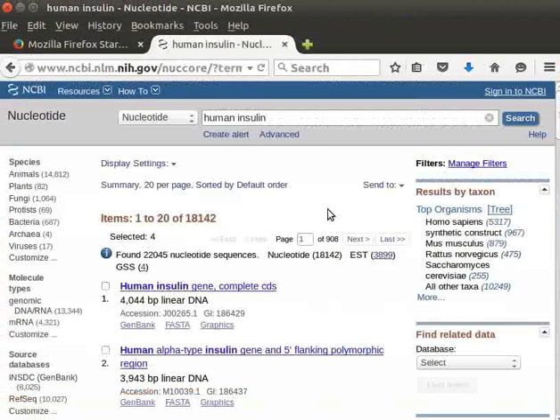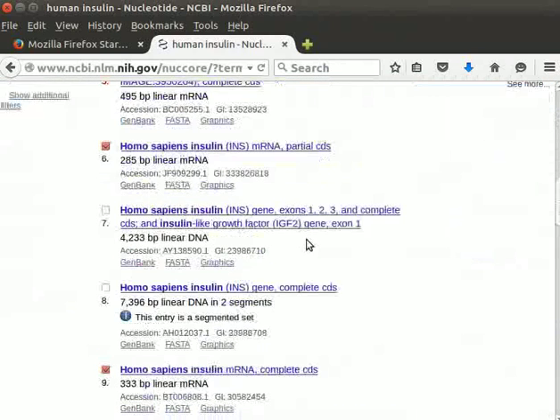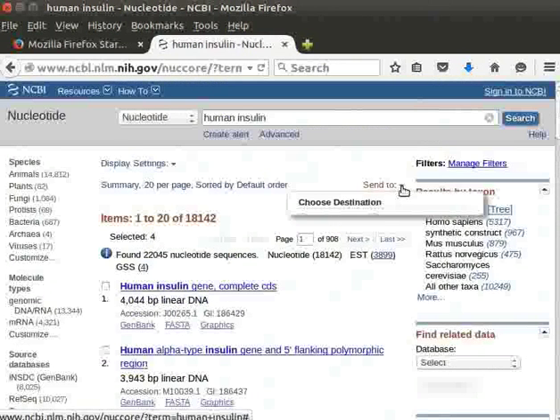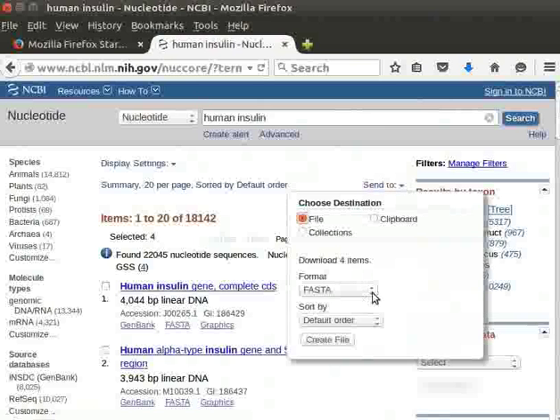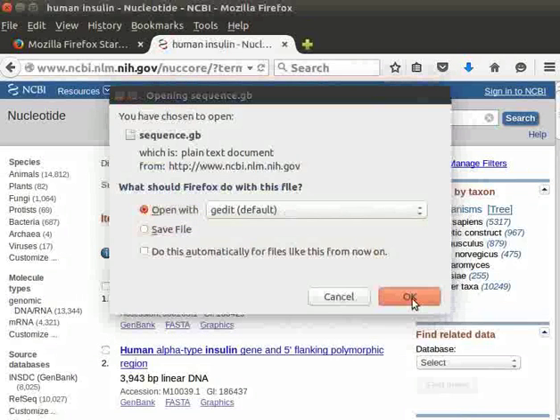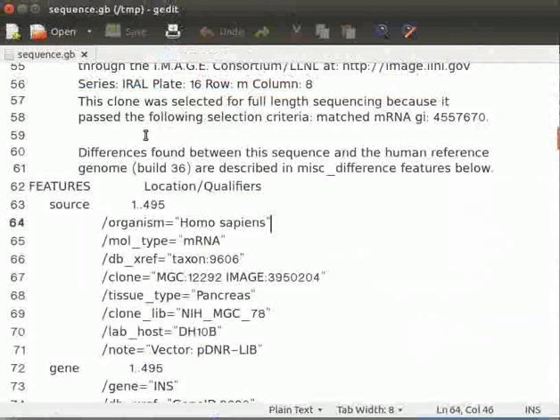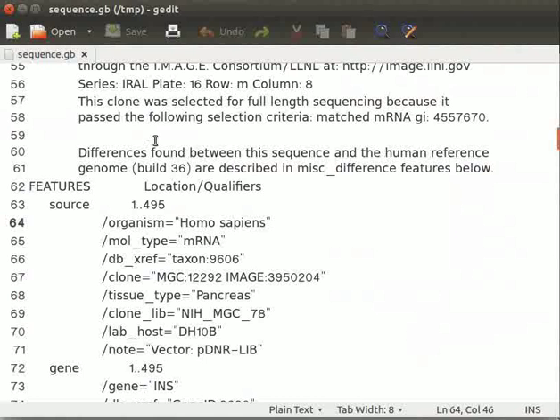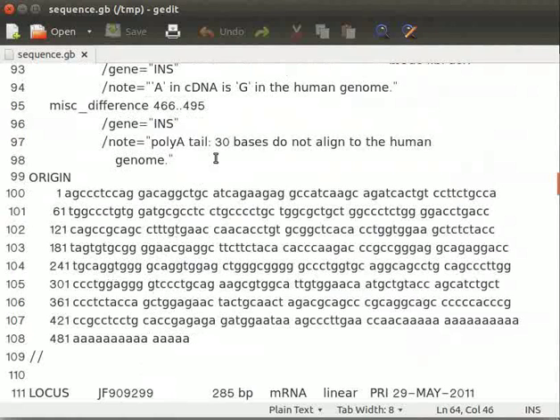Close the text editor. Follow the same steps as above to download the files in GenBank format for the same files selected earlier. Select the file format as GenBank and create a file. Open it with a text editor. Notice that the sequence file in GenBank format has more features than a FASTA file. Save the file as sequence.gb in your home folder.